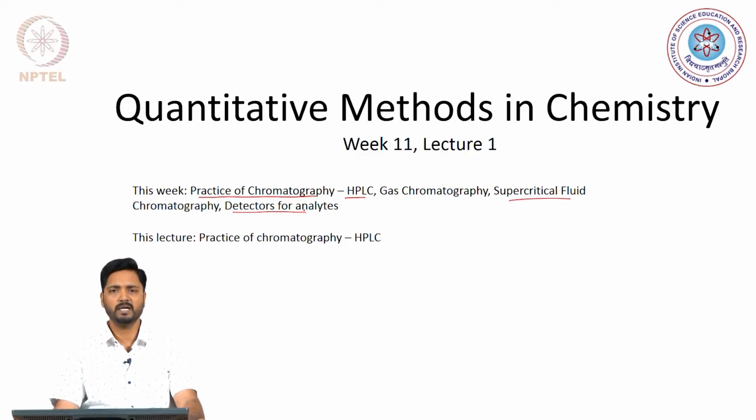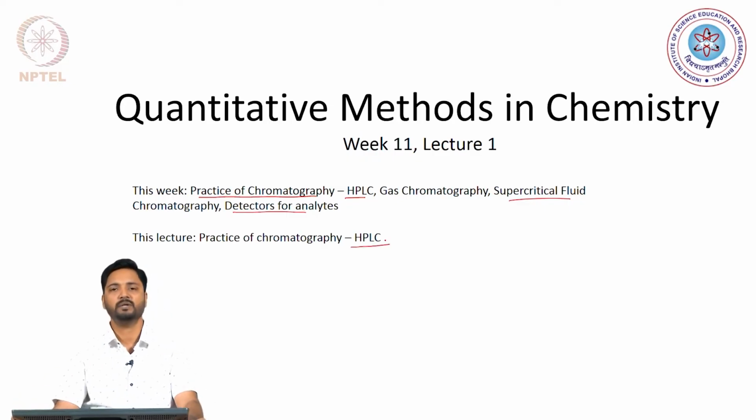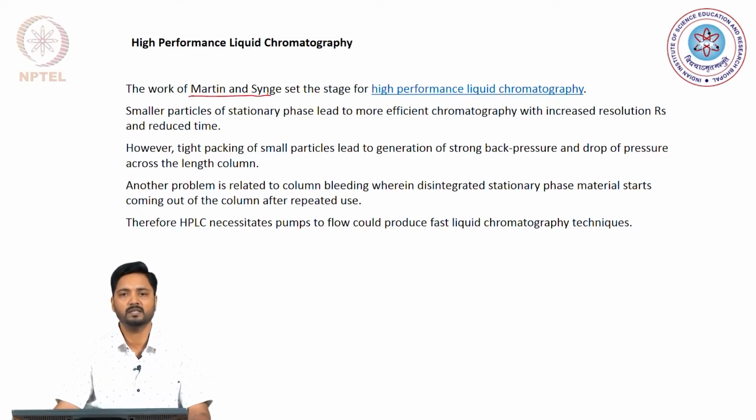So, let us begin lecture 1 by understanding how high performance liquid chromatography works in real practice, and as has been already indicated in the previous lecture, the work of Martin and Synge is considered to be important in terms of developing high performance liquid chromatography.